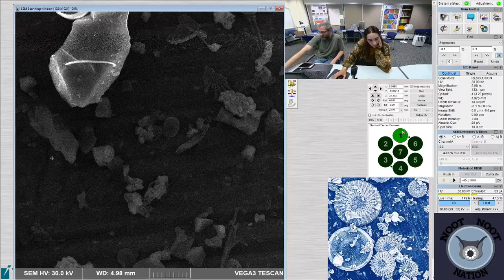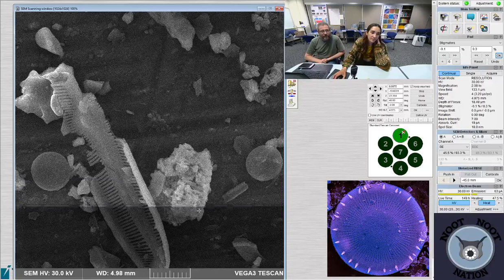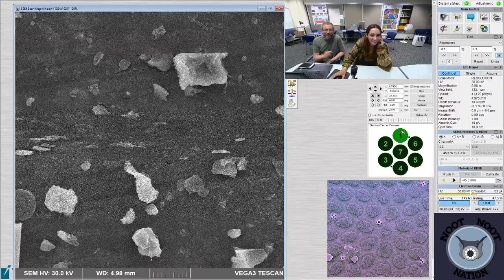Is this a freshwater sample from nearby? No, it's a sample from California, and it's a freshwater lake, though. And these are surface samples. For some reason, whenever we stream, Laura only ever looks at one sample. We have 7 mounted samples in the SEM at once. We've done 3 streams like this, and one time she looked at 7, one time she looked at 1, and one time she looked at 3.